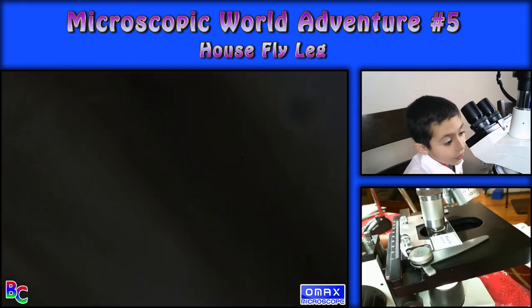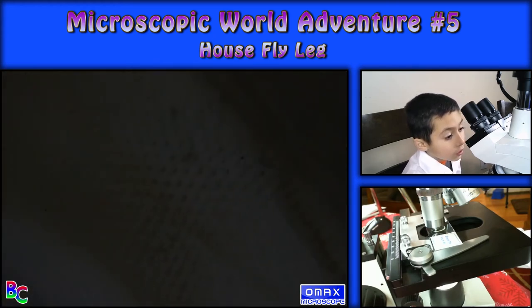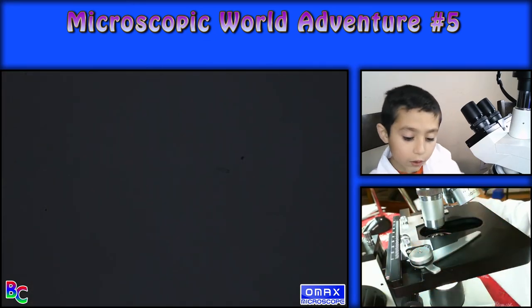Because I can see nothing. Oh, actually I was wrong — you can see part of it. See, you can see that. Wow, I had no idea. So that was the last one.